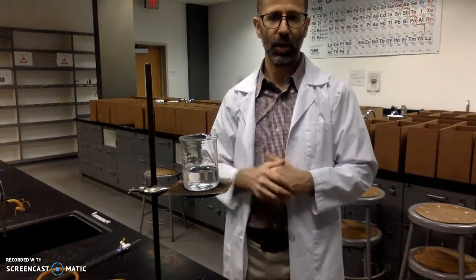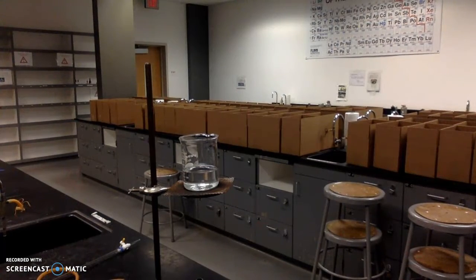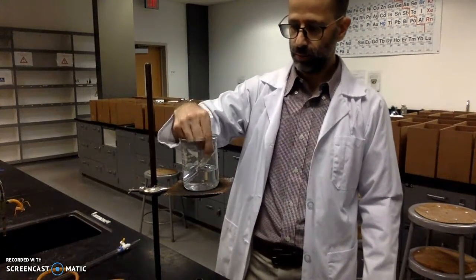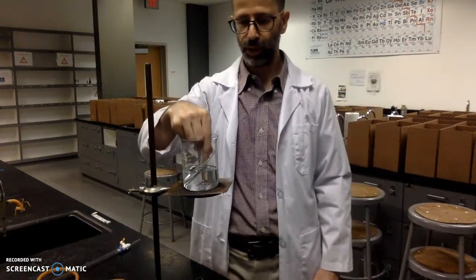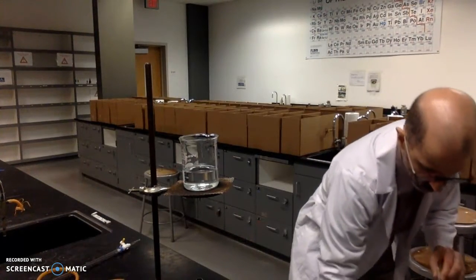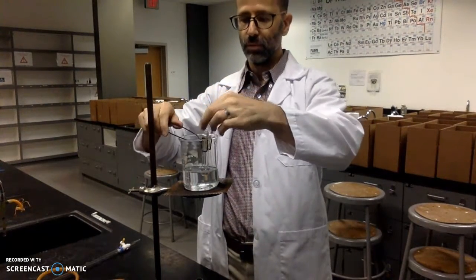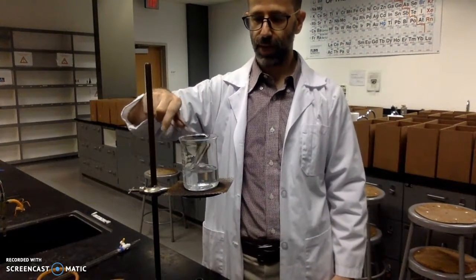After about a minute of boiling it in the water, you take your test tube and put it in the water for a little bit, right? You just have to make sure that water doesn't get inside. And then, of course, you have your test tube holder, so you could always do it this way. You could set it in like that, and then take it out when you're ready.